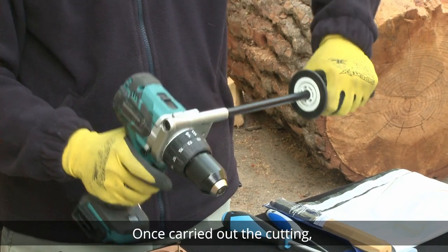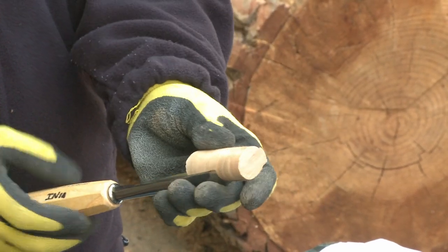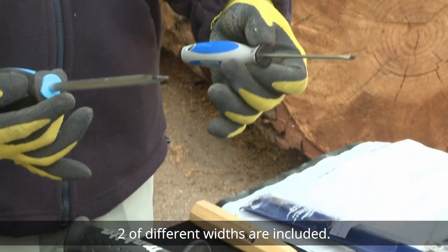Once the cutting is carried out, the cap is removed using a semicircular gauge. As an alternative to the gouge, we can use screwdrivers. Two of different widths are included.